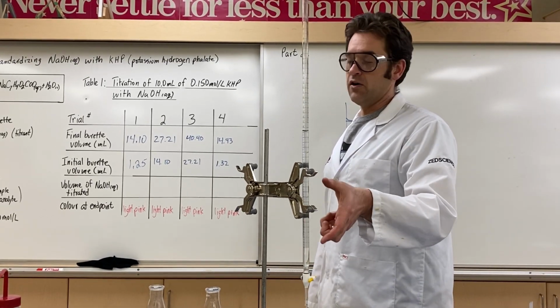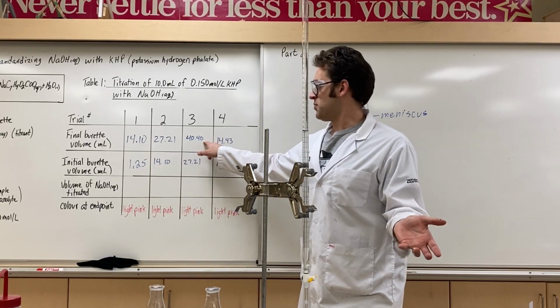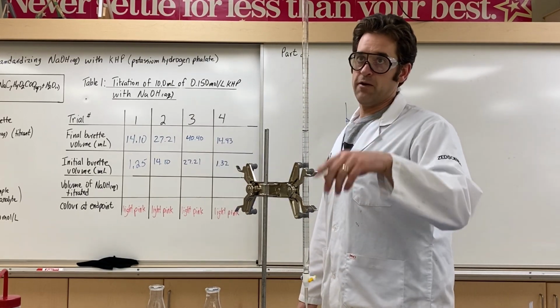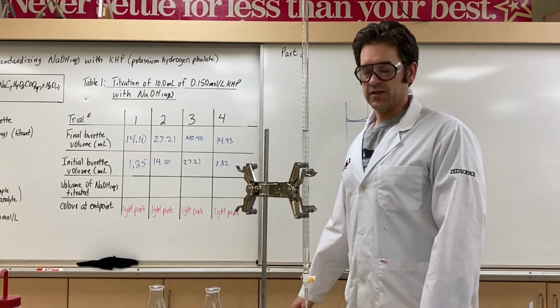So if you get close and you're like, oh, we're using about 13 each time, and if you're at 40, last time I checked, 40 plus 13 is a little more than 50. Be on the safe side and refill the burette. And remember, you don't have to get it all the way up to the top. I filled it to 1.32. Like, you just get close and you start again because you subtract and you get it.